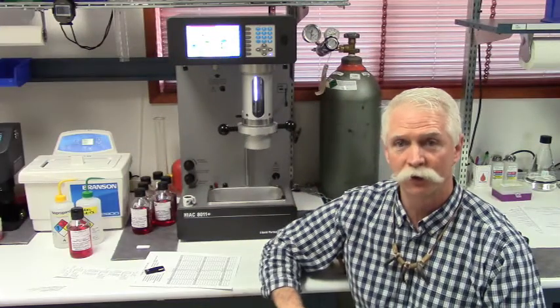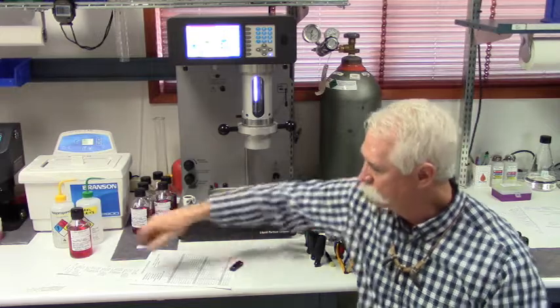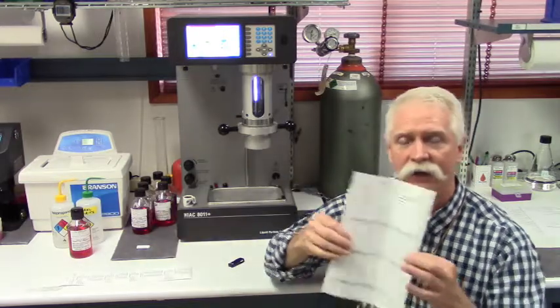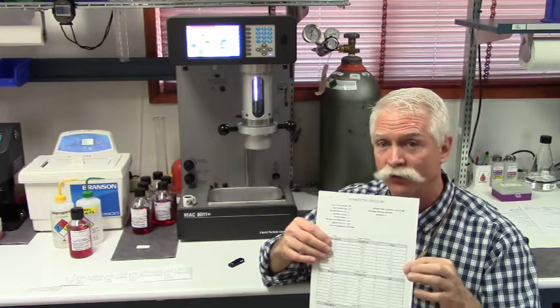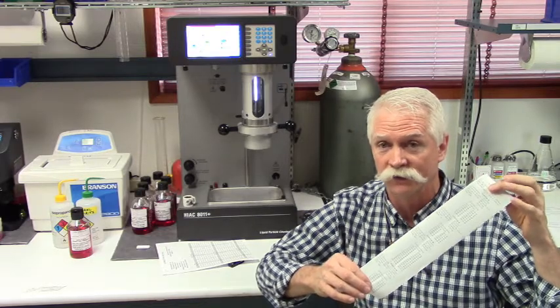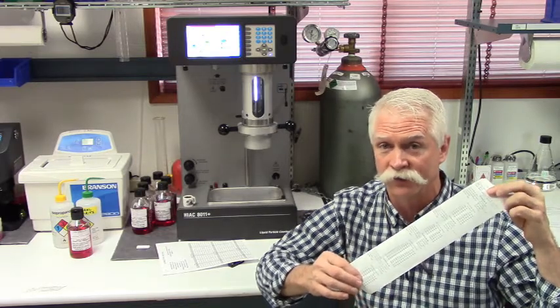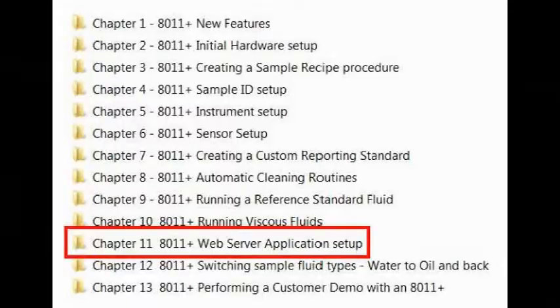When the sample is complete, then you're going to show them our reporting methods. You can show them how we can export data out to a USB. You can show them how we can print out a PDF copy of the sample result. You can also show them a strip print of what they can expect if they have a USB printer that they purchased from us, the only USB printer that's available for this system. And you can also walk them through the web server setup if they wish to do that data manipulation over their Ethernet.